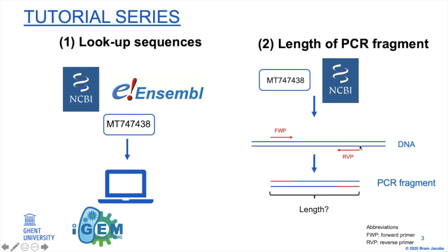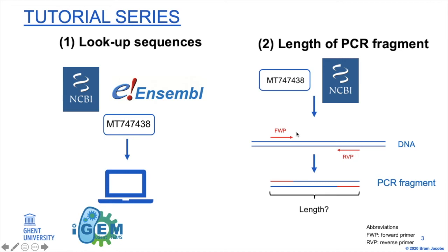And we know that the last nucleotide of the reverse primer is this one. So now, if we want to calculate the length of the fragment, so from here until here, we have to say that this is exactly match 2 minus match 1, so that you only obtain this region of the sequence, plus the length of the forward primer, so that we have this length plus this length, so that we obtain the length of this complete chunk of the DNA fragment.